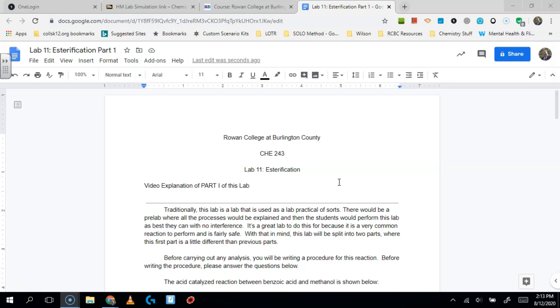Hey everybody, this is the video explanation for the first part of Lab 11, Esterification, and this lab is going to be a little bit different. It's going to be split into two parts. The way that I usually do things in the lab is I use this lab as a culminating lab practical, because the lab itself is pretty straightforward to carry out.